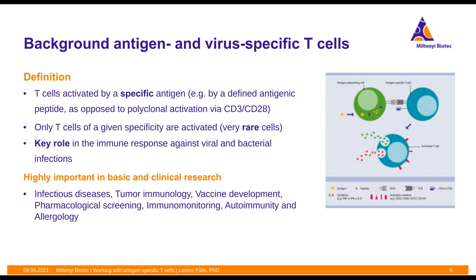So they are very important, as for example, in infectious diseases, tumor immunology, but also more recently very important in the development of these new candidate vaccines against SARS-CoV-2, pharmacological screening, immunomonitoring, autoimmunity, but also allergy.